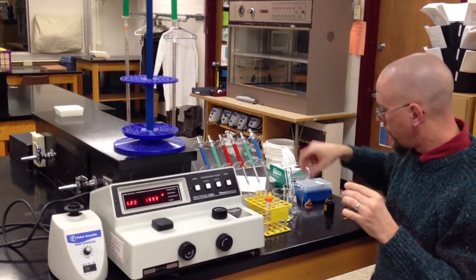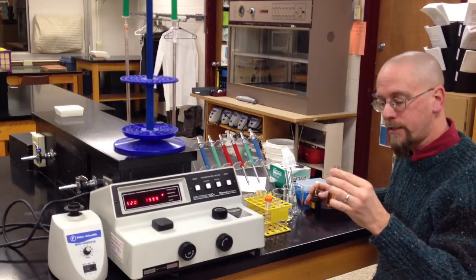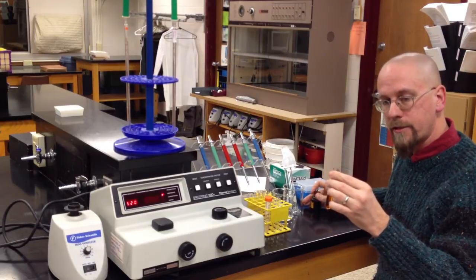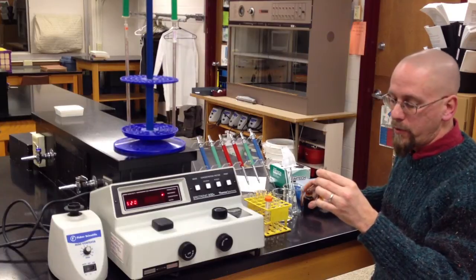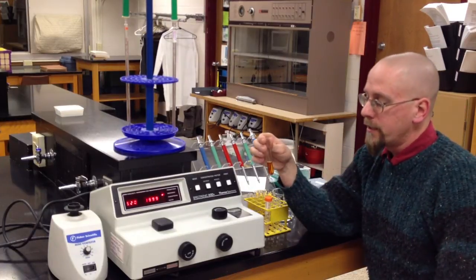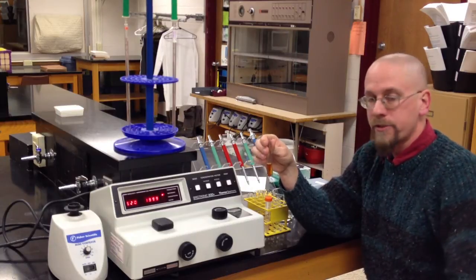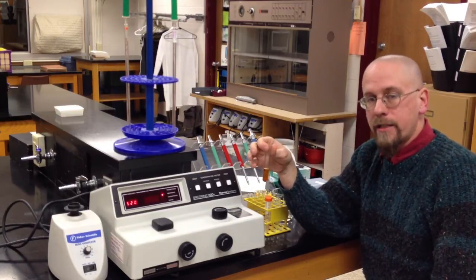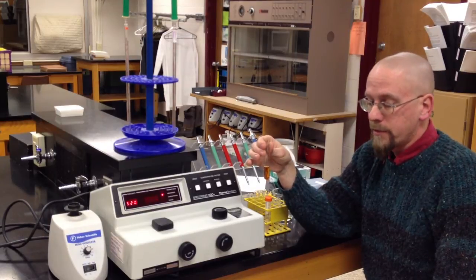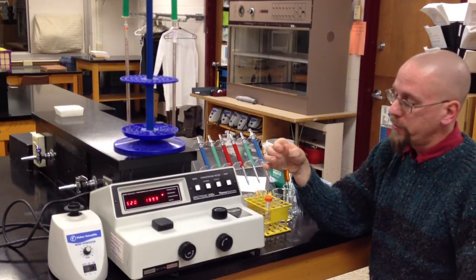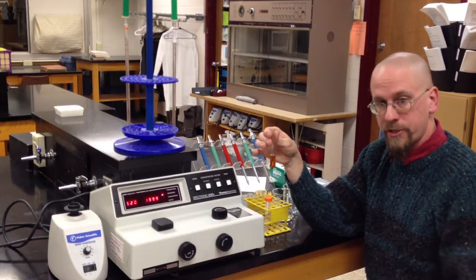Well, how are we going to measure the effect of amylase on starch? Because it's not something we can see directly. Well, we're going to take advantage of a peculiar chemical property of starch in that it turns black or very dark blue in the presence of iodine. So we can use that to our advantage with this instrument.